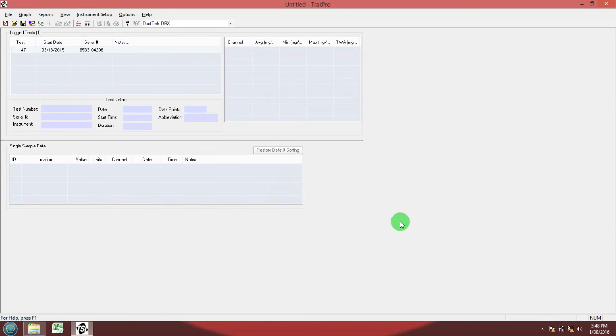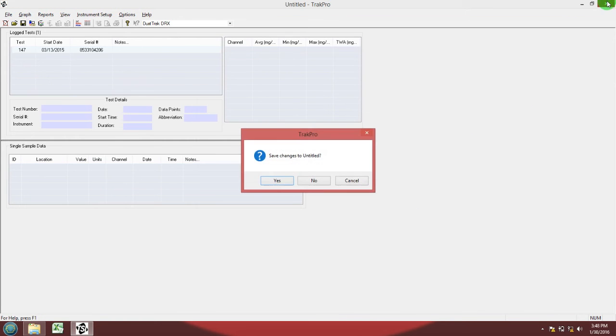Now you can close the TRACK PRO software. Don't save it.